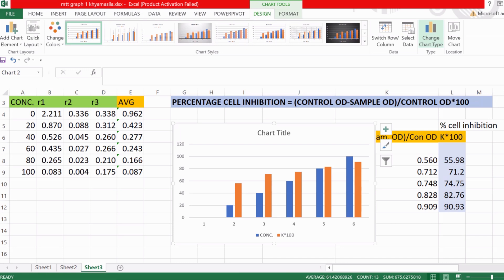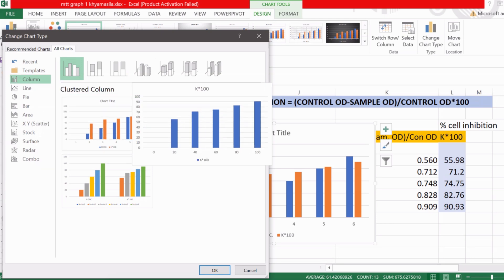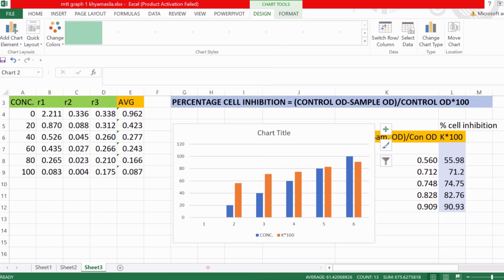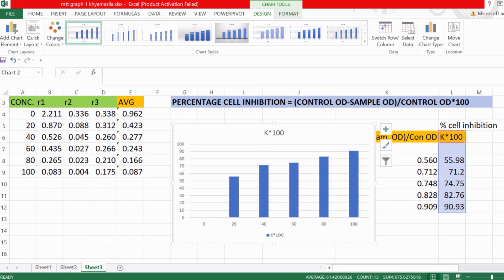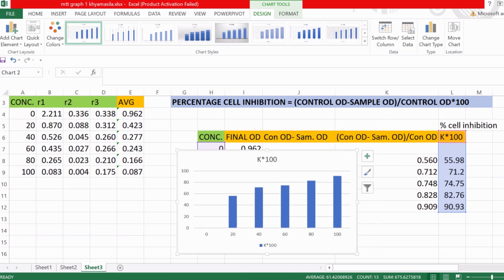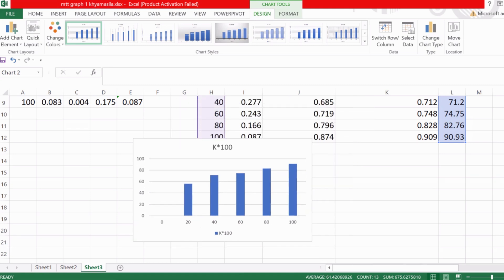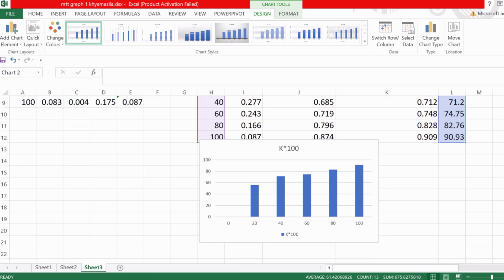Go to Change Chart Type, click on it, select the second column chart option, and press OK. This will give you the proper graph that you require. Now you can modify your graph as needed.